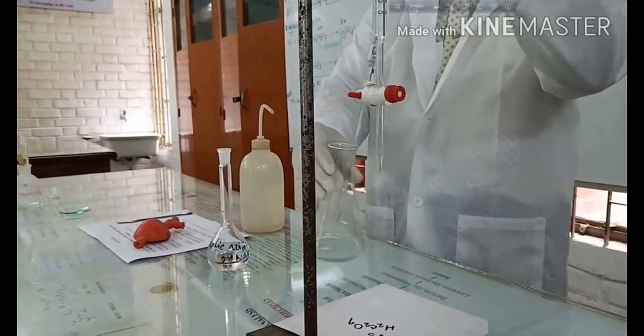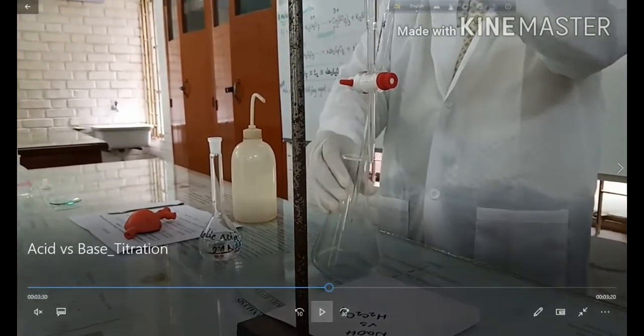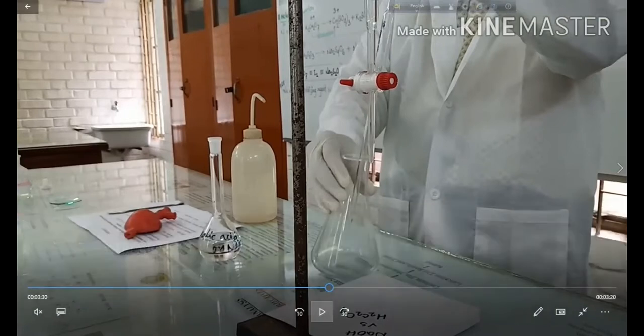After taking 10 ml of oxalic acid, you can add some water, because you can see that when you are taking 10 ml in a large volume conical flask, the amount is very small, so we cannot find out the color perfectly, and we cannot shake it perfectly. So for that reason, you can use some water here. It will not change the concentration of the particles, it will just change the volume; all the particles in the 10 ml solution will be the same before and after adding water. So don't be confused about why it's getting diluted.